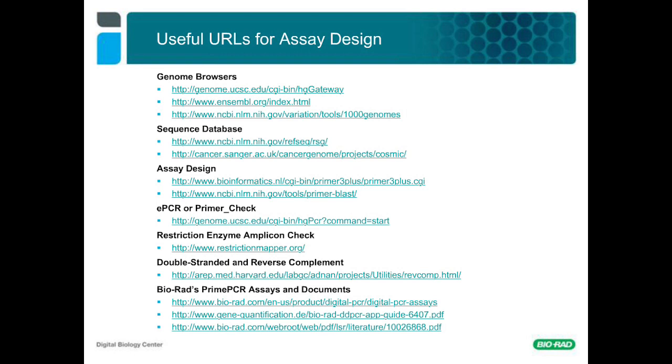So along the same lines, do you need a restriction digestion step for FFPE samples? That's another very, very excellent question. We've recently done a study on FFPE samples with and without digestion, and we found that most of the time the digestion step helped even with the most fragmented FFPE samples. So yes, we do recommend that you digest with FFPE samples.